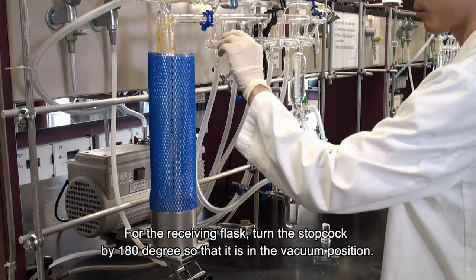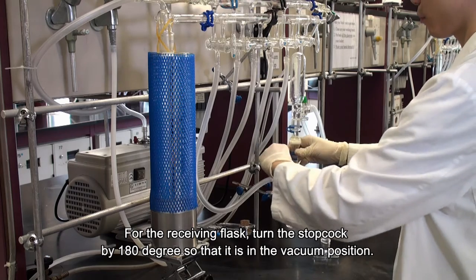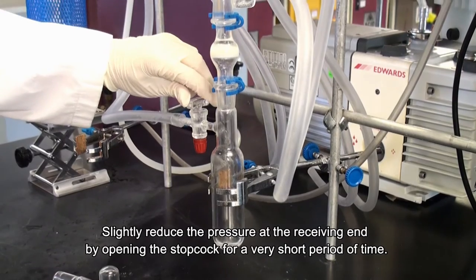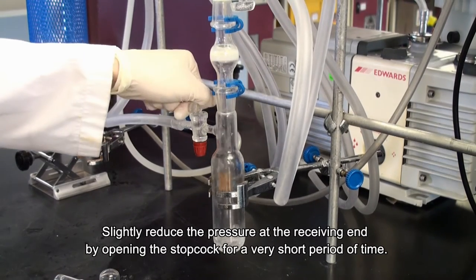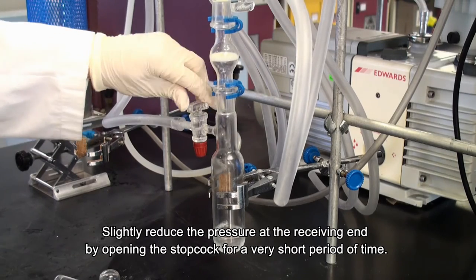For the receiving flask, turn the stopcock by 180 degrees so that it is in the vacuum position. Slightly reduce the pressure at the receiving end by opening the stopcock for a very short period of time to speed up the filtration.